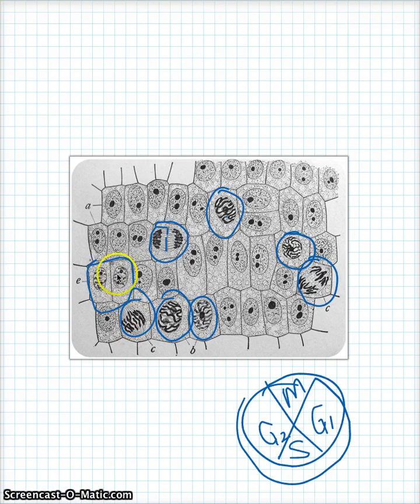Well, that looks like, to me, a very late telophase. Maybe just almost an interphase, or maybe just barely starting interphase. These nuclei are so small compared to these other ones. We can tell they're baby cells. They're brand new cells.